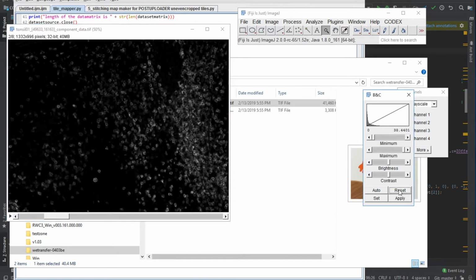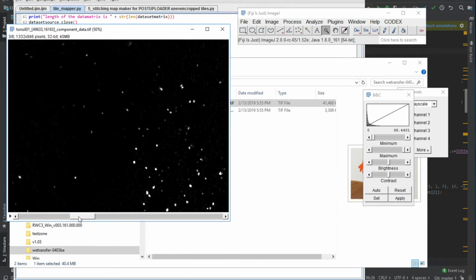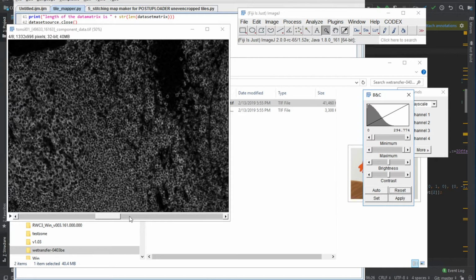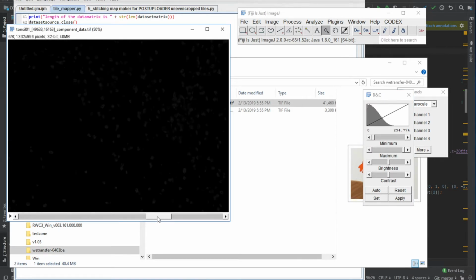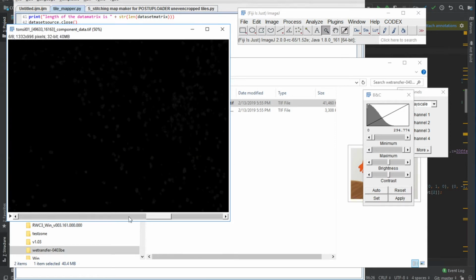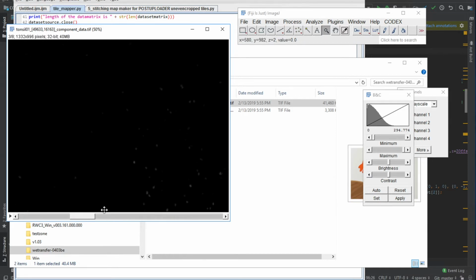Reset, and it's probably a peculiarity of ImageJ software, but what can we do? 1, 2, 3, 4. Now CD45 looks, Jesus, looks crappy again. Reset. Okay. Yeah, that looks pretty good now. I think what happens is that it cannot apply individual resets into the whole stack.